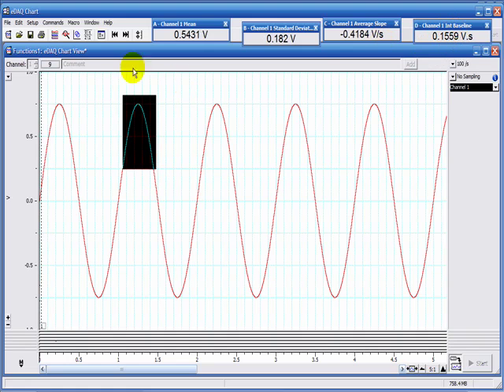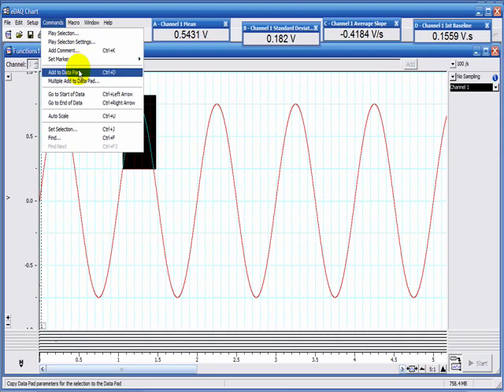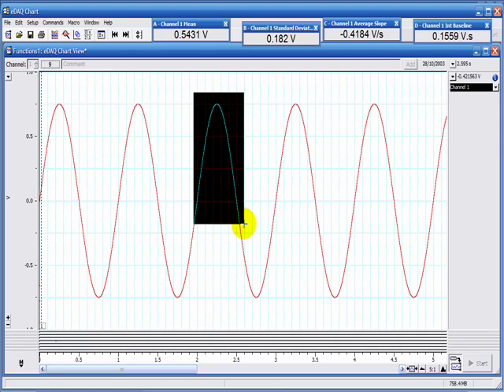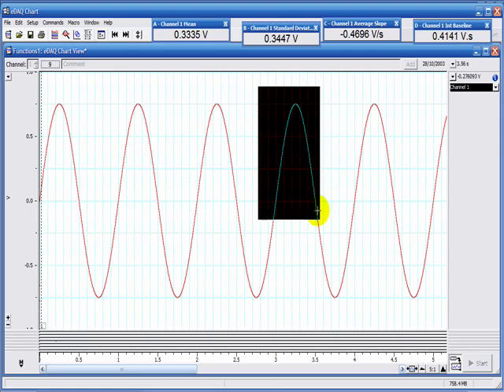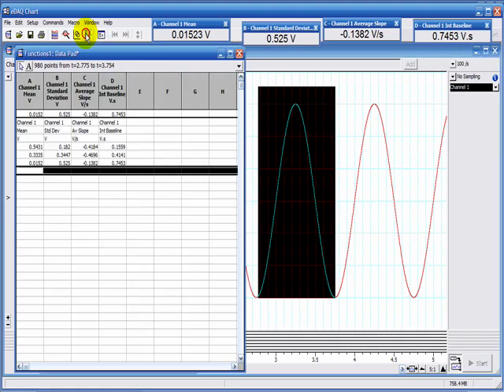And I can add this data to the data pad. In commands, I add to data pad, which is control D on the keyboard. So I do that once, I choose another area, do control D, choose another area for the peak, do control D.